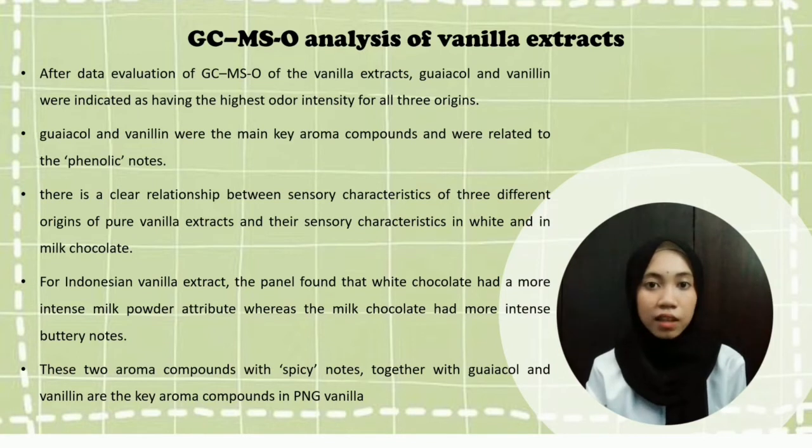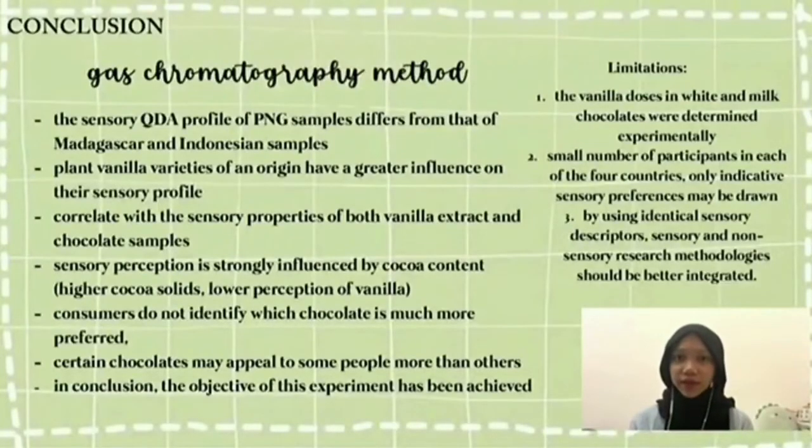tahitensis vanilla extract by V. planifolia could impact the sensory profile of the chocolate, but this effect would be minimized if the cocoa content was relatively high, such as in a dark standard chocolate recipe. By gas chromatography, the sensory QDA profile of PNG samples differs from that of the Madagascar and Indonesian samples.